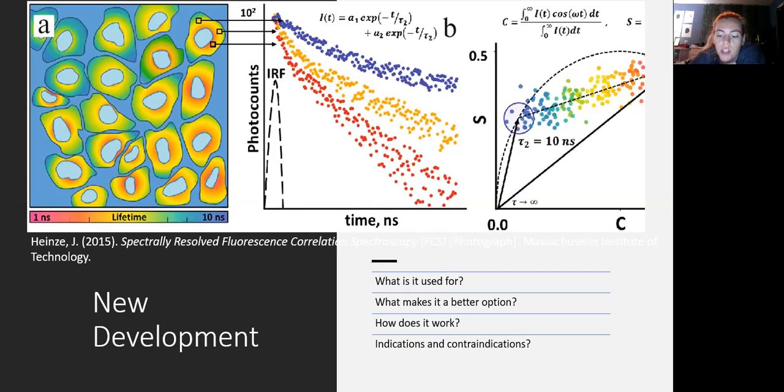And the use of the ultra short pulsed laser with a near infrared emission gave off a lot of radiation. So just doing it on mice, while it's still something that is very new and not well understood, is the best that can be done currently. And they usually require multiple scans, so that's a lot of radiation that keeps going, and we are all told about ALARA, that any contraindication is if they're going to get too much radiation.